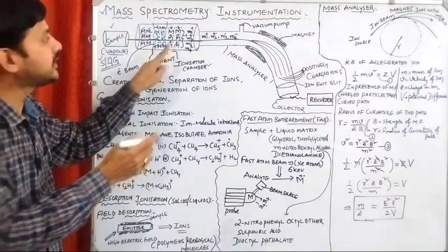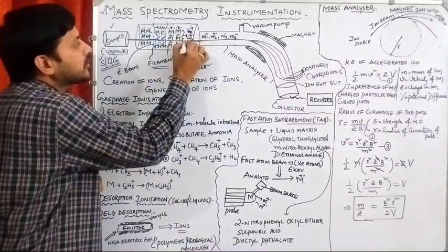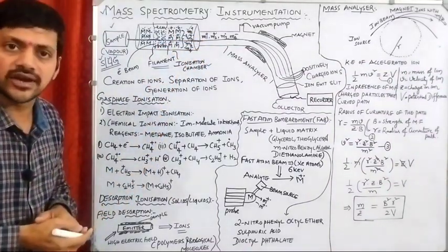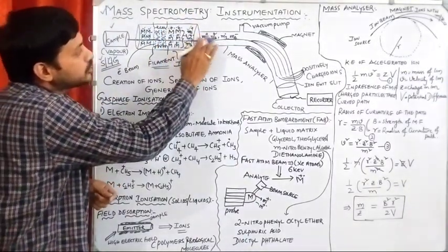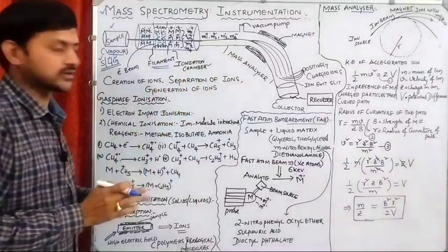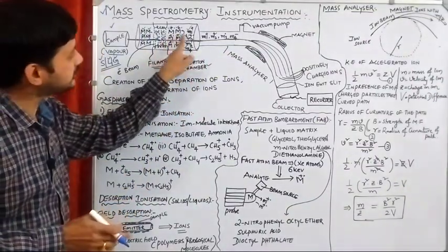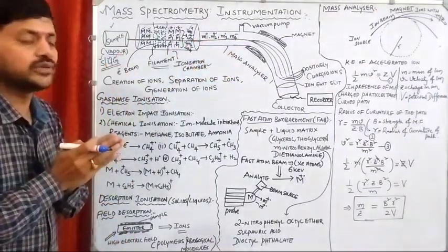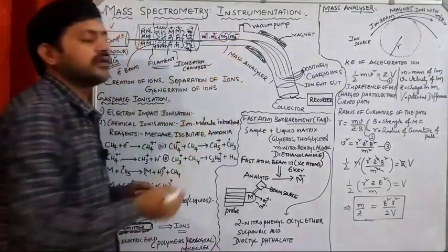All the molecular ions are subjected to fragmentation, thereby we come up with simple cations, radical cations, radicals and negatively charged species. All these species enter the mass analyzer from the ionization chamber. Once they are formed, we remove the radicals and negatively charged ions.